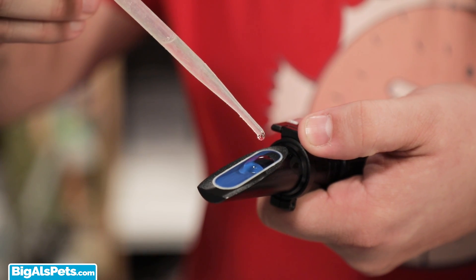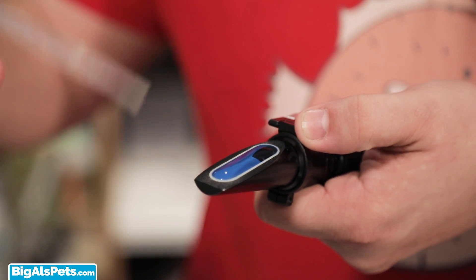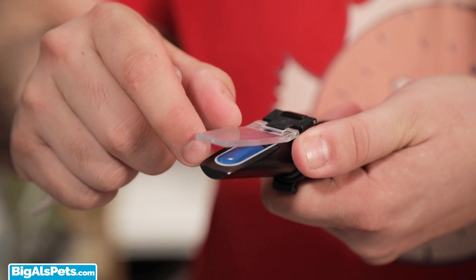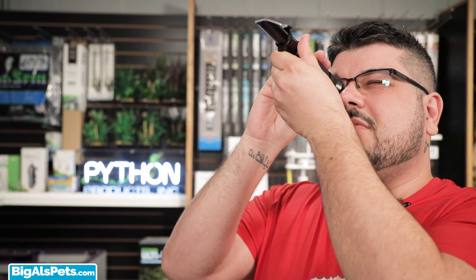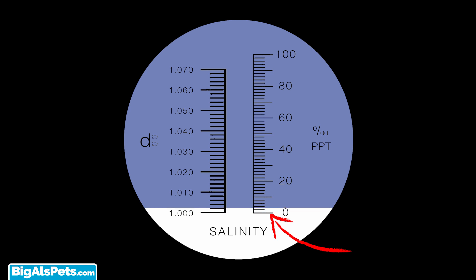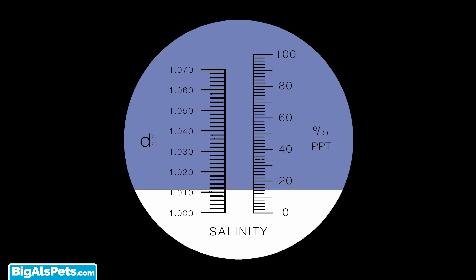Now that we have everything, let's get calibrating. First thing we're going to do is take our pipette and add a few drops of ultra-pure water to the prism. For this step, you can use distilled or RO water as we just need to ensure that our solution has zero salts. We can then look through our refractometer and look to see that the line where the blue and white meet is at zero. If it's not at zero, use a screwdriver to adjust the line to be at zero.